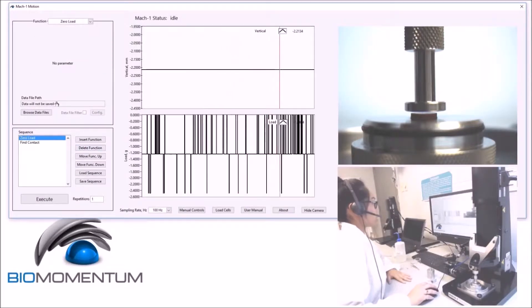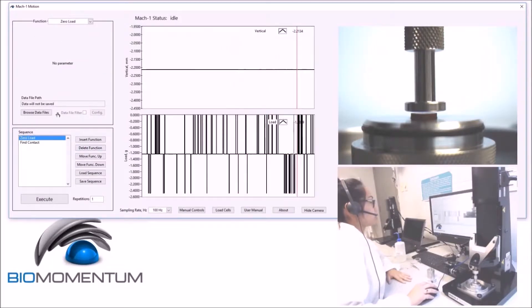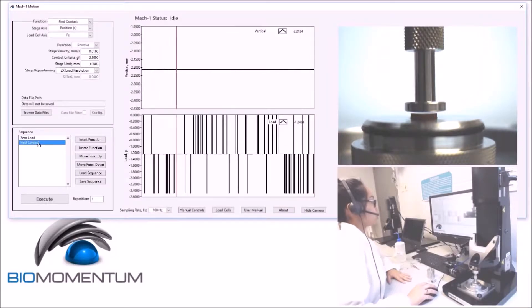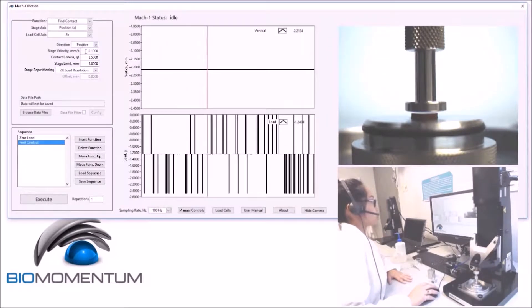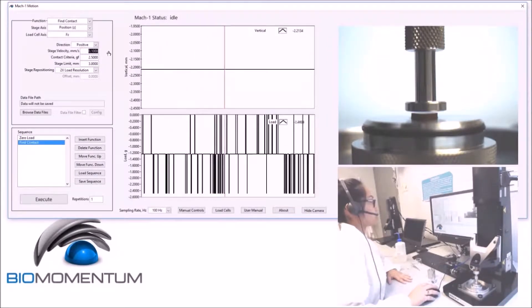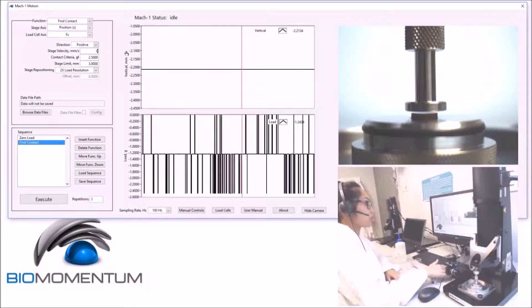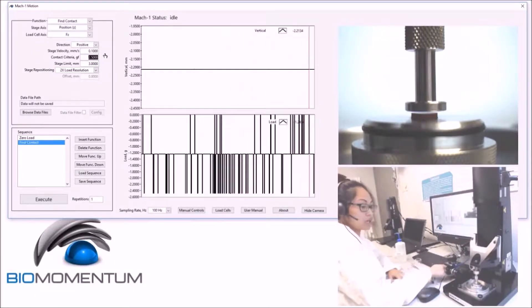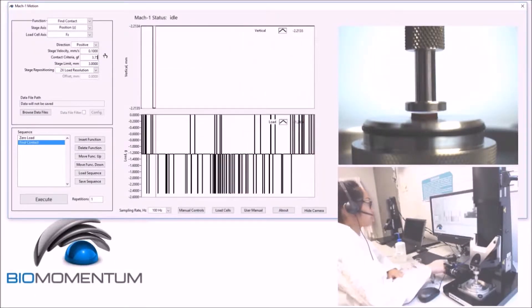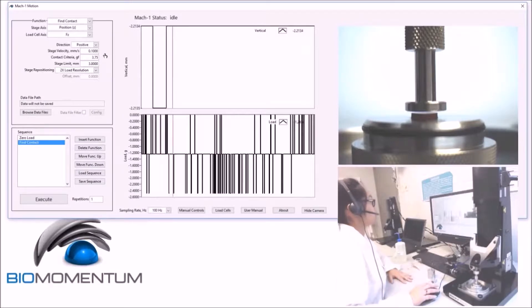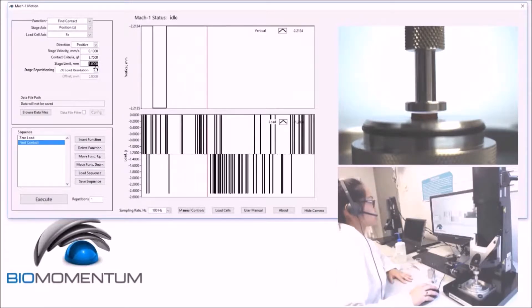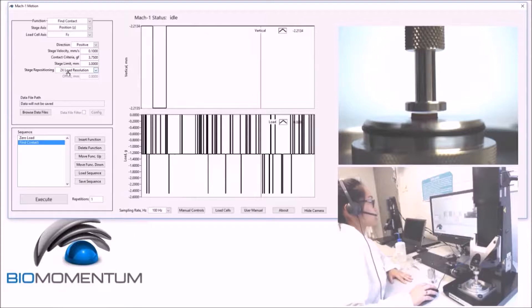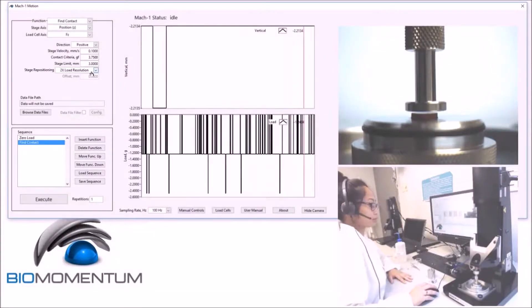A zero load as the first function, followed by a fine contact with a velocity of 0.1 and a contact criteria of 3.75. A stage limit of 3mm and a stage repositioning of 2 times the load cell resolution.